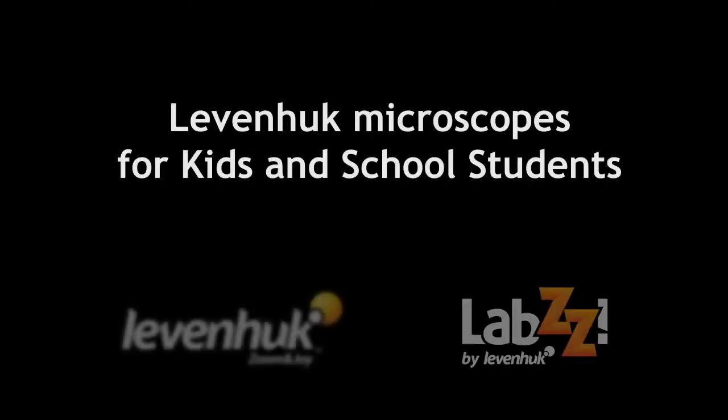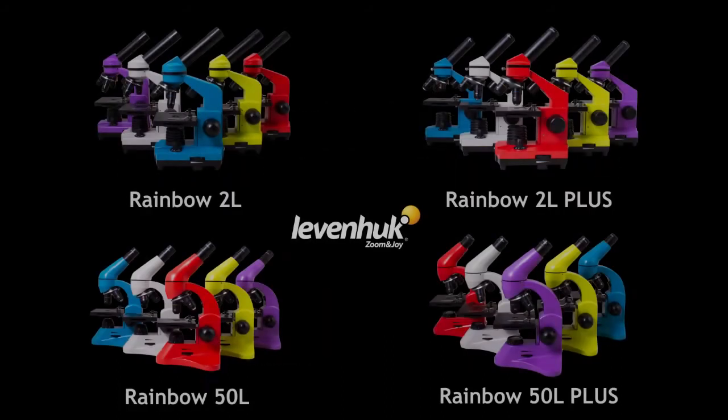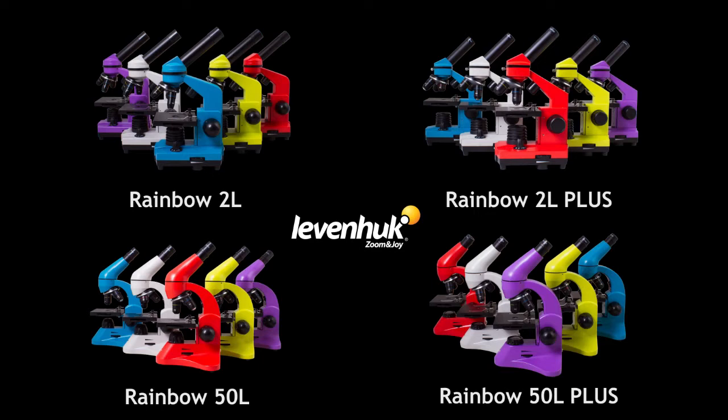In this video we would like to introduce Levenhuk school microscopes of the Levenhuk Rainbow and Levenhuk Labs lineups. The Levenhuk Rainbow microscopes include models designed for kids and teenagers and everyone mesmerized by the mysteries of the microcosm. These instruments are great for entry-level observations as well as for basic laboratory studies.